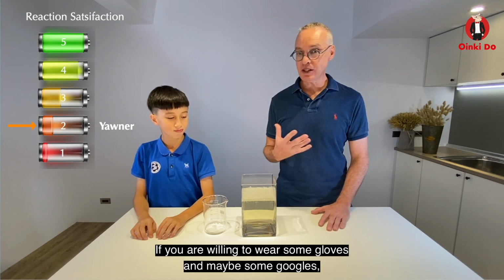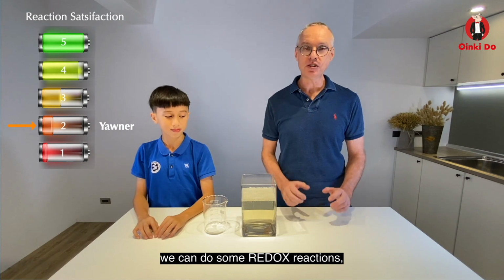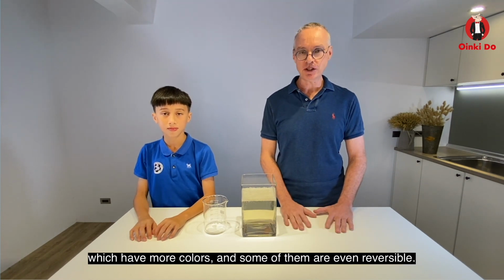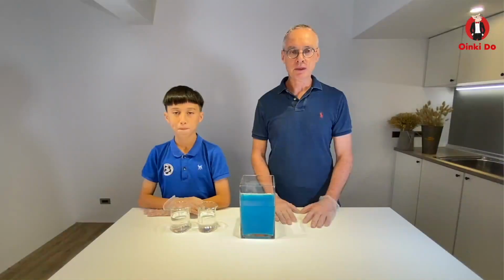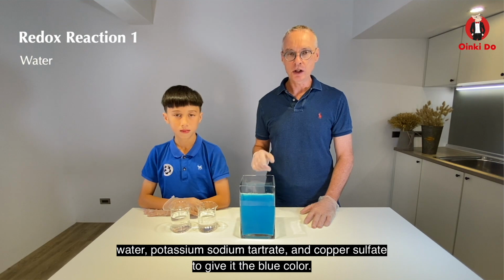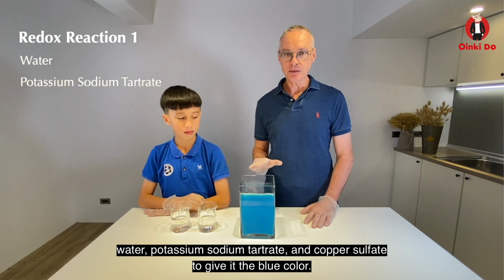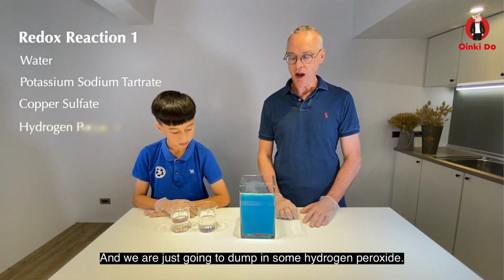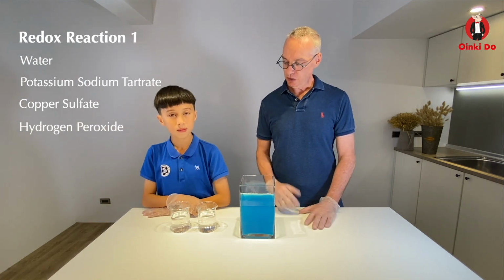If you're willing to wear some gloves and maybe some goggles, we can do some redox reactions which have more colors and some of them are even reversible. Hand me the gloves. Ting, this first redox reaction uses a solution that has water, potassium sodium tartrate, and some copper sulfate to give it the blue color. And then we're just going to dump in some hydrogen peroxide and see what we get. Want to give it a try?